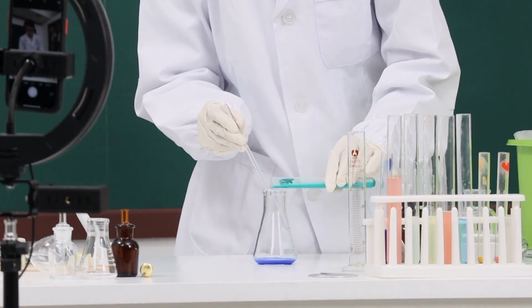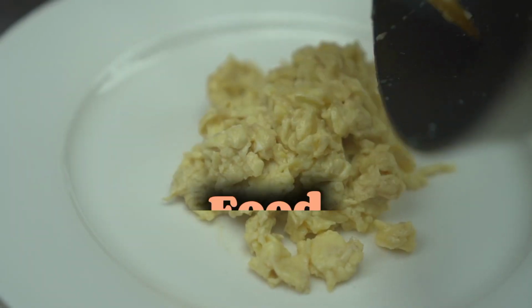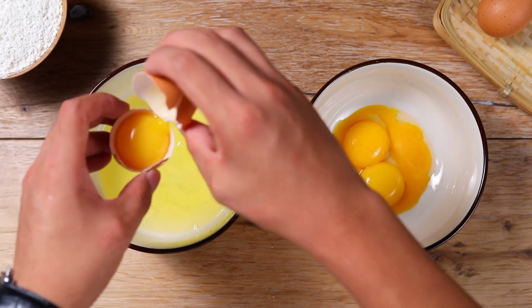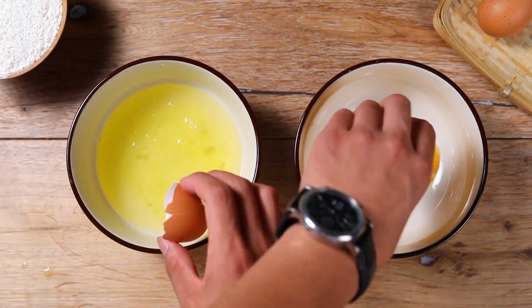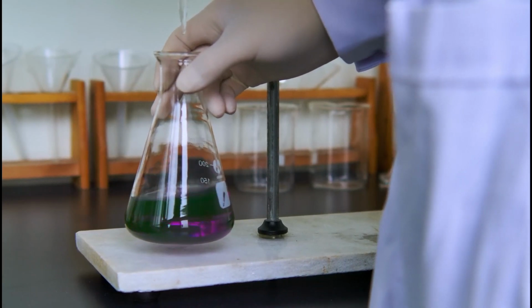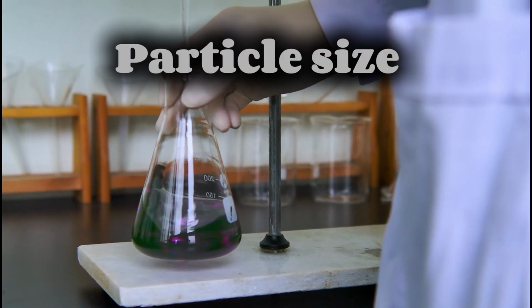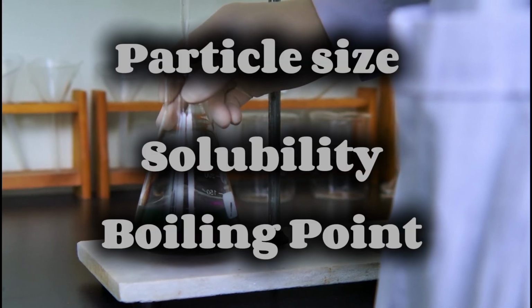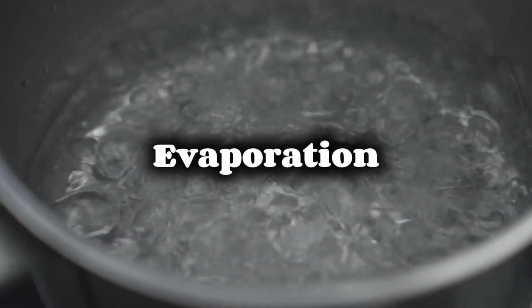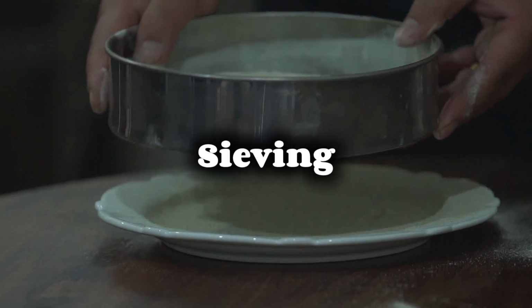We often encounter mixtures in our daily life, like air, salt water, and even the food we eat. But sometimes, we need to separate the components of these mixtures for various purposes. In chemistry, there are different techniques used to separate mixtures depending on their physical properties such as particle size, solubility, or boiling point. In this experiment, we'll focus on two of them: evaporation, which separates a solid dissolved in a liquid, and sieving, which separates solids of different particle sizes.